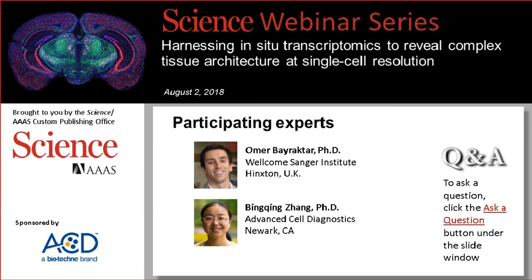Let me give you one final question before we close, and we have received a couple of queries on this topic. Is there any reason that the technique that you're using could not be applied to other mammalian brains, particularly human, and what might the challenges be to doing this? Mm-hmm. So we have actually designed LastMap with large tissue area screening in mind. So I think amongst all of the available single molecule FISH or in situ sequencing options, ours is the best option for looking at large tissue areas.